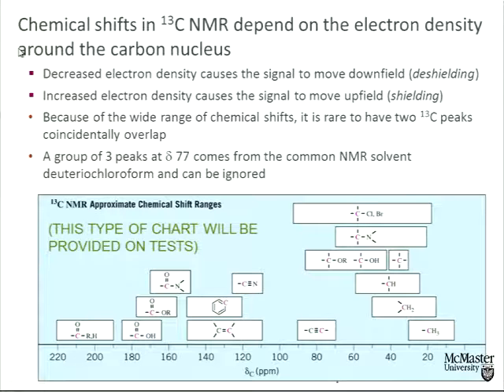Benzene rings, alkenes, nitriles. Notice there's a huge divide here, right around 100 ppm. Everything to the left of 100 is sp or sp2. Everything to the right of 100 is sp3, with the exception of the triple bonds, which are right on the edge. So it's a very handy way to count the carbons. Not only can we count the carbons, but we can count the number of sp3 hybridized carbons and the number of sp2 hybridized carbons in the molecule. So we're beginning to gain information. Back to chloropropanol. There was nothing above 100 ppm, so in that spectrum there are no sp2 hybridized carbons.